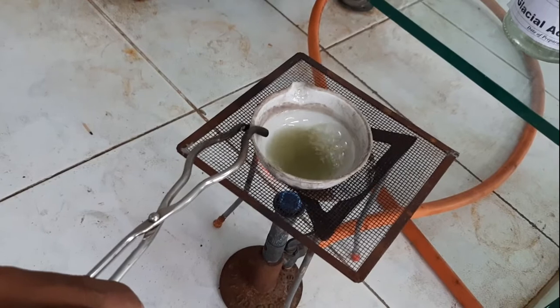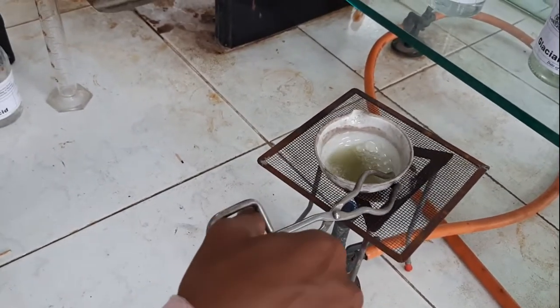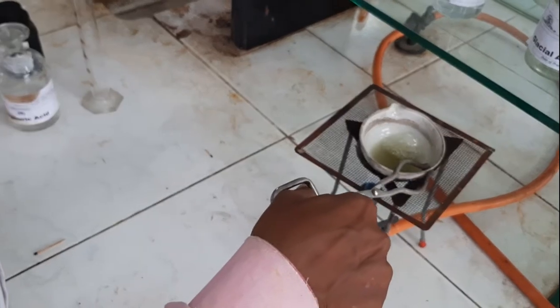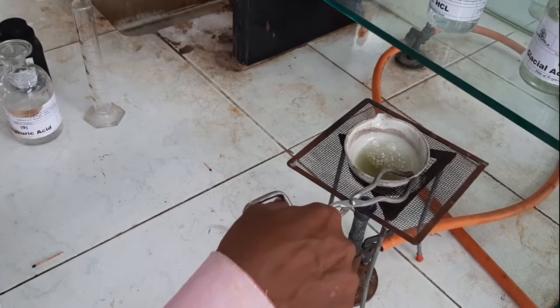We will allow it to concentrate completely here and completely evaporate the water.